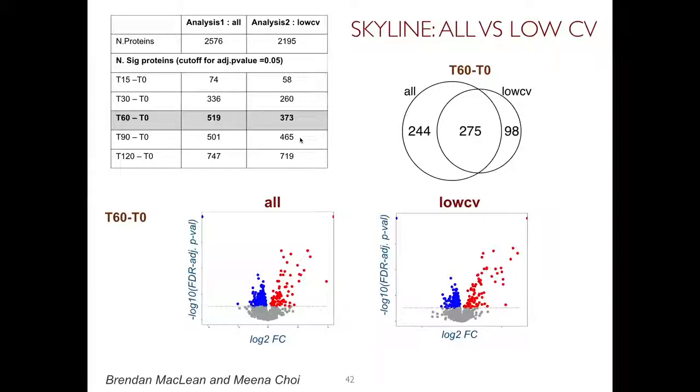Well, what we know from biology, and this biological system, by the way, was selected because a lot of biology is known about the stress, is that as time progresses, more and more proteins become involved and become activated, and so we expect more and more proteins becoming upregulated in time. On the surface, we would say, okay, everything looks good because we identified more proteins, and if you just compare numbers, they're higher, right? So we consistently find more differentially abundant proteins. But then it's kind of suspicious because if you look at these 2 time points, going from 330, a very big jump to 500, but then it goes down and then it goes back up. This is not something which we would expect biologically.